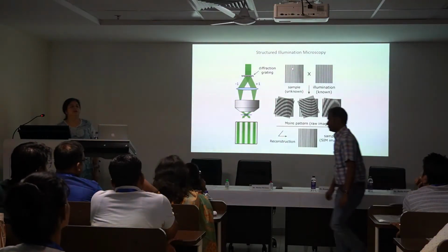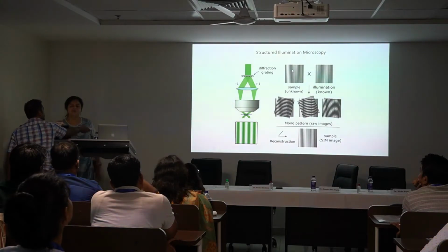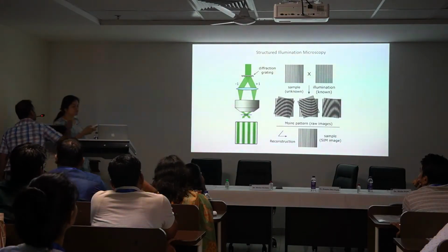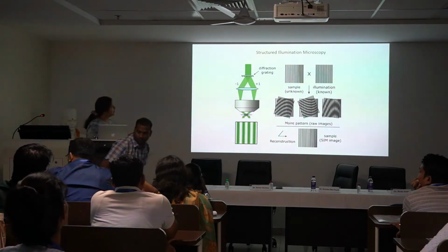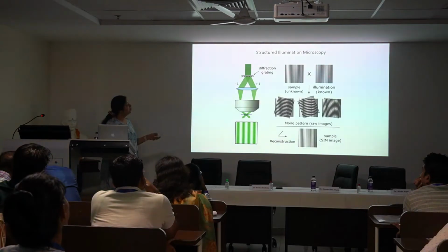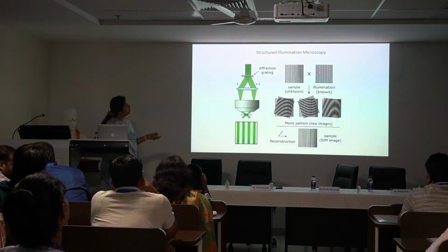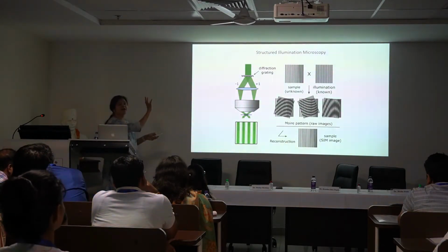It's a boring sample actually, because even the illumination is in a patterned way. Now it can be in various different orientations, and this orientation of illumination overlaps with a sample, which can be complicated. So this is the highly simplified example shown here.